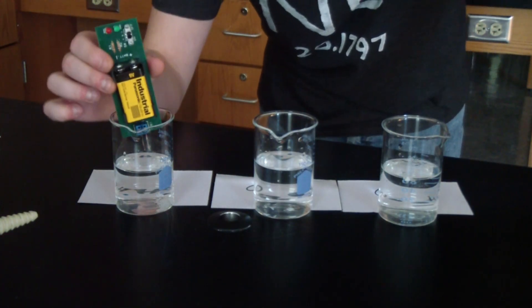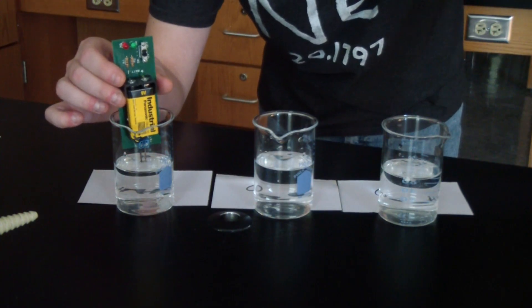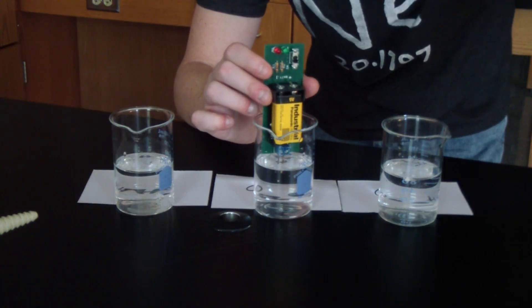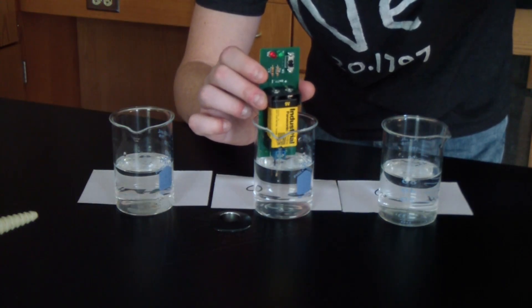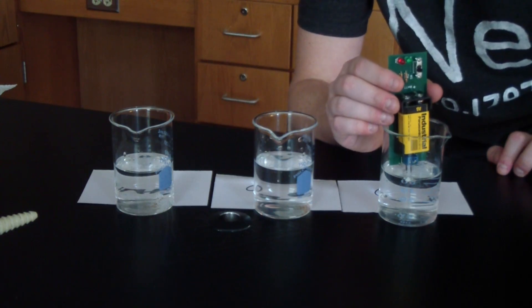So this first one here is something called P-dichlorobenzene, which is used in mothballs. And you can see that this one doesn't conduct electricity. Sugar, or sucrose, also does not conduct electricity. And wax also does not conduct electricity.